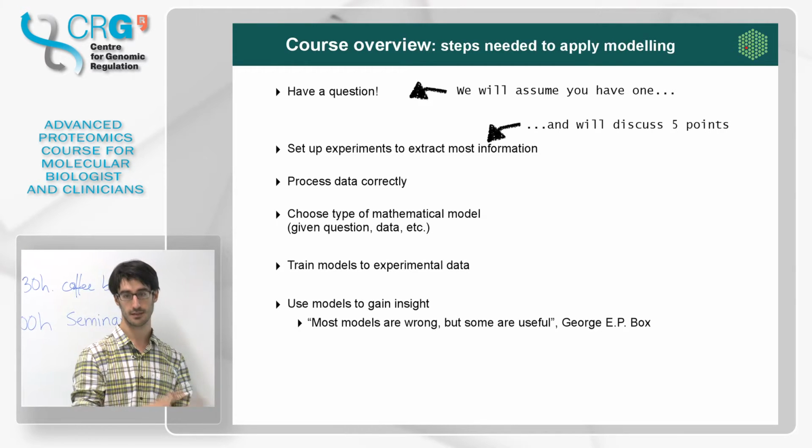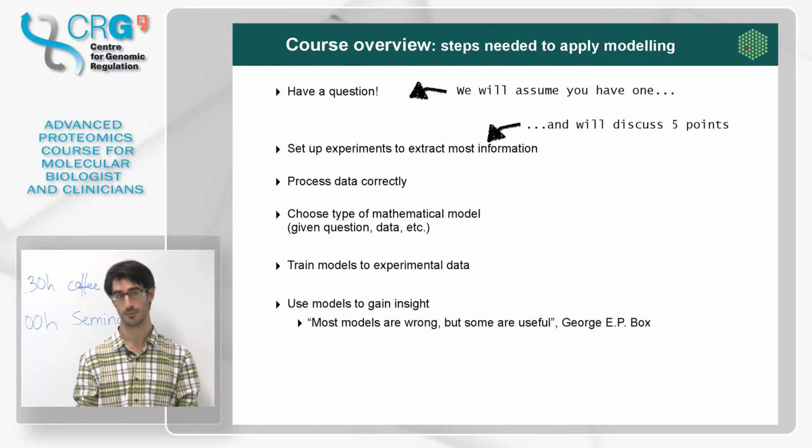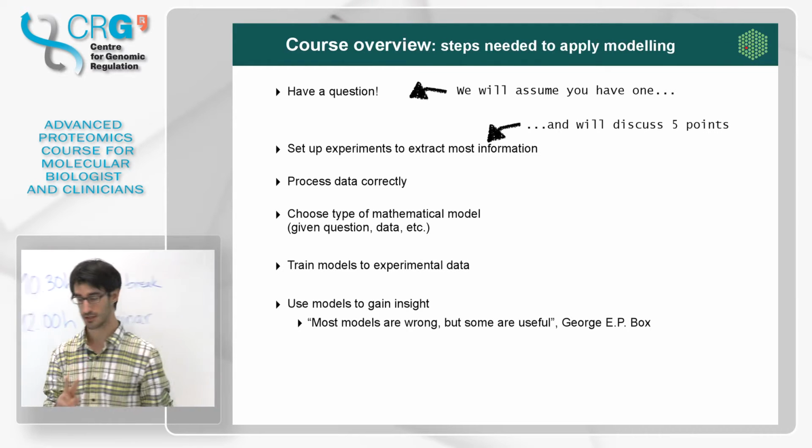That's discovery-based. The second part is going to be prior knowledge-driven. So we're going to do something like I introduced yesterday. We will assume that you have a signaling pathway that you're interested in, or a process, and you already know what your hypothesis is, and then we're going to try to compare that to data and do all of that. So it's 2 hands-on sessions.